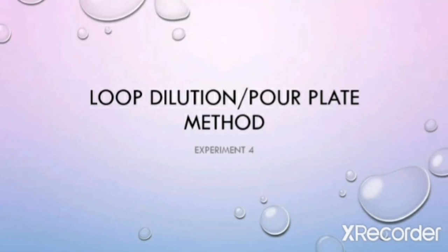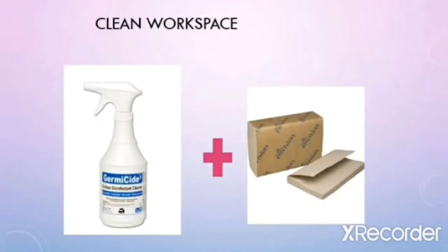In this video, I will be showing you how to do the loop dilution pour plate method. But before we begin, you need to wash down your workspace. Use germicide and paper towels to do so.